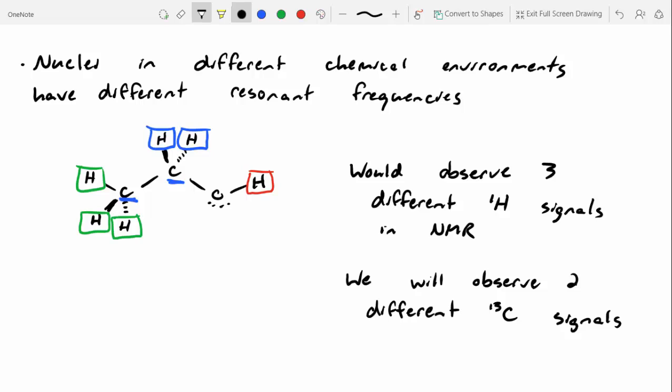Does it work for oxygen too? Yeah, so oxygen-16 you can't see. However, with exotic isotopes of oxygen, you can. It's not very common, though. Same with nitrogen. The most common NMR that you use in organic chemistry is proton and carbon NMR, far and away, because most of the compounds we look at have a relatively high abundance of carbon-13 in them. Granted, it's only 1%, and there's plenty of proton. Oxygen, the other isotopes, are just not nearly abundant enough to be seen.